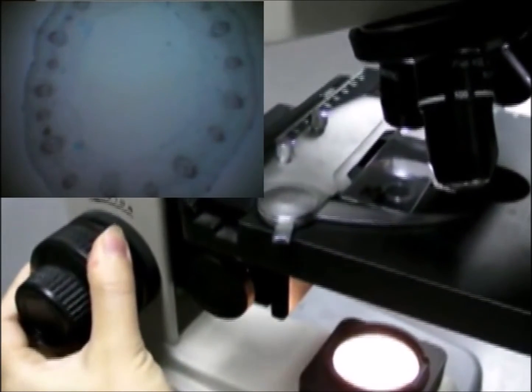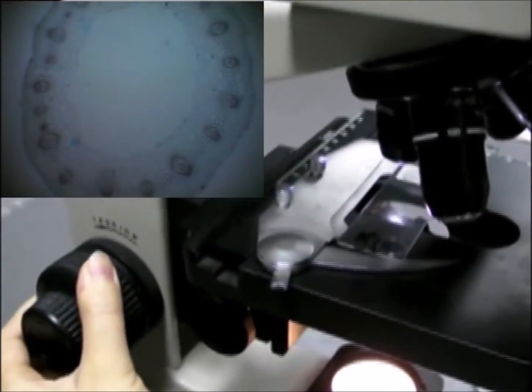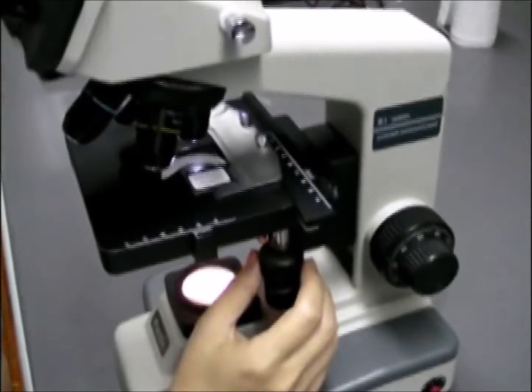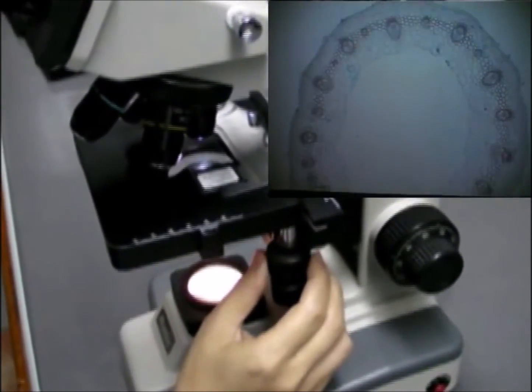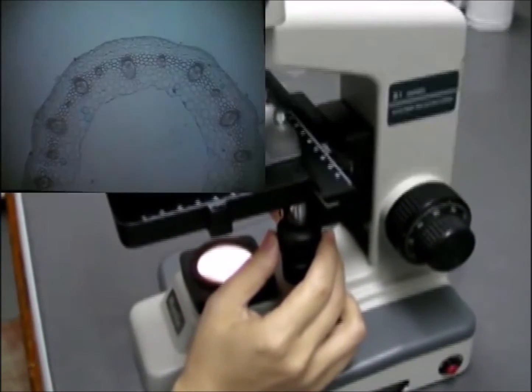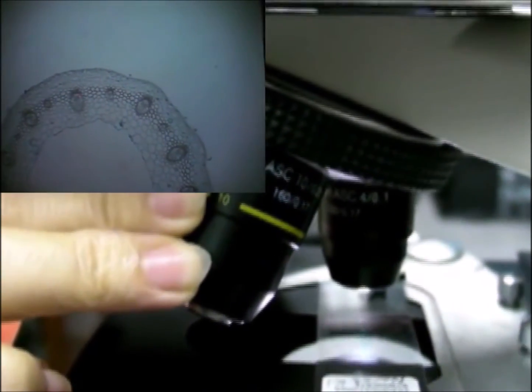Look into the eyepiece. The object is not in focus yet, so it will be blurred. Focus the object by turning the coarse focusing knob until you see the clearest image. You only use the coarse focusing knob for focusing at the lowest magnification. You can scan around the specimen to look for a good representative cell in which most of the structures are clear to be viewed at a higher power. Move the slide horizontally so that you can bring the chosen cell to the center of the field of view. Label field of view.